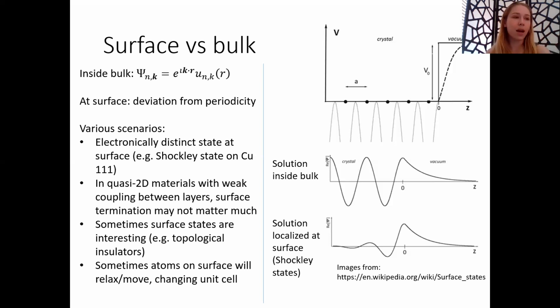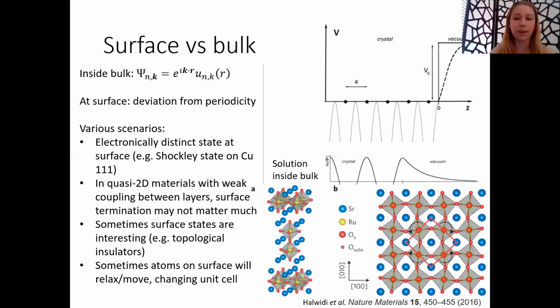Many materials, specifically topological quantum materials, have distinct surface and bulk states that define their unique and interesting properties. And the fact that you can specifically measure the surface state is a strong attribute of this technique.